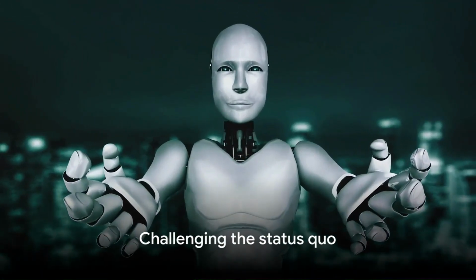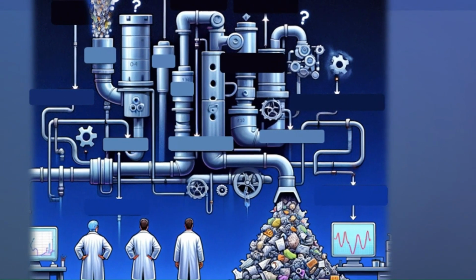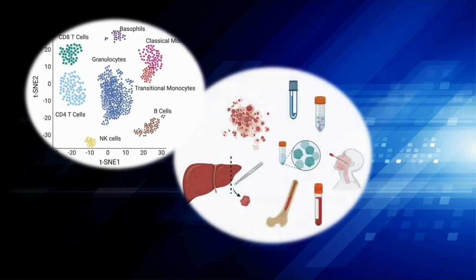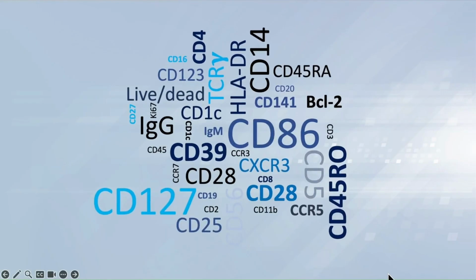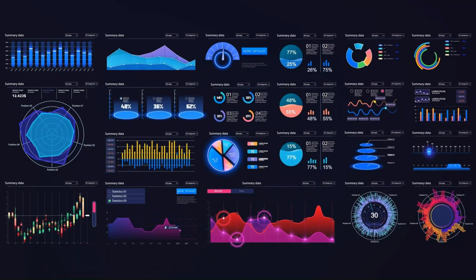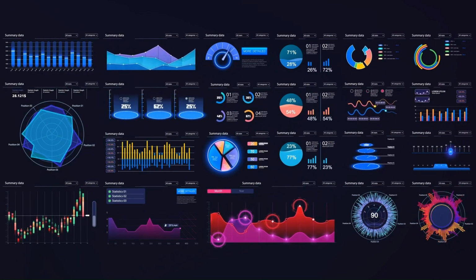Good AI requires good data. The old adage, garbage in, garbage out, applies now more than ever. This is true not only for cytometry data itself, but also for data annotation and key metadata such as sample type, patient status, and more. As cytometry moves into the ultra-high parameter space of panels looking at 50 or more markers, new techniques must be developed by manufacturers, cytometrists, and bioinformaticians to ensure that increasingly large cytometry datasets are usable and valuable for AI applications.